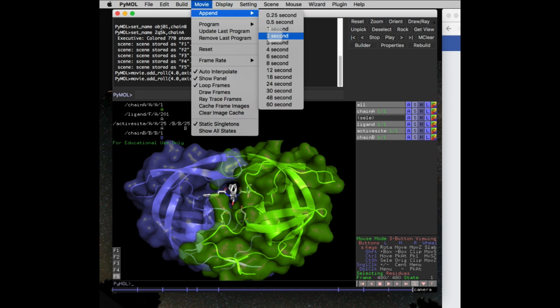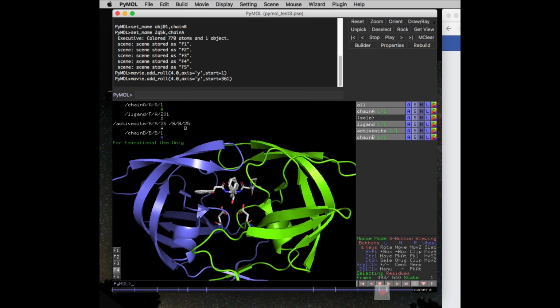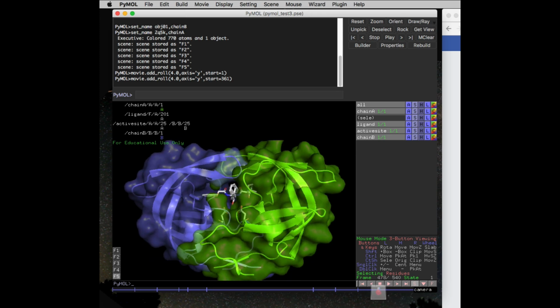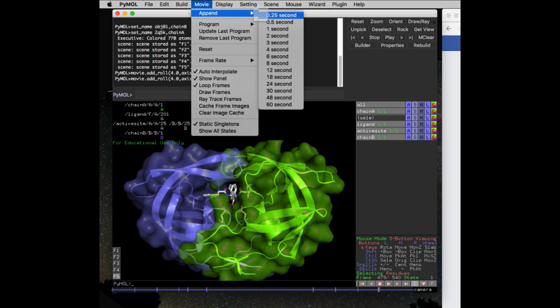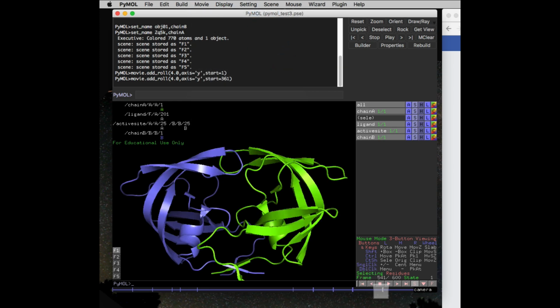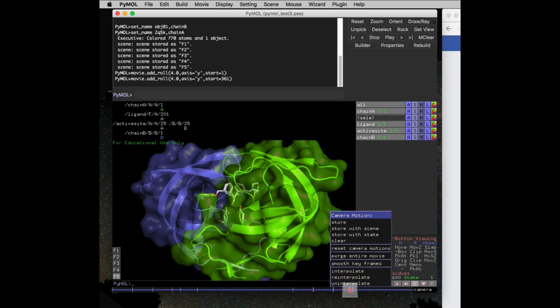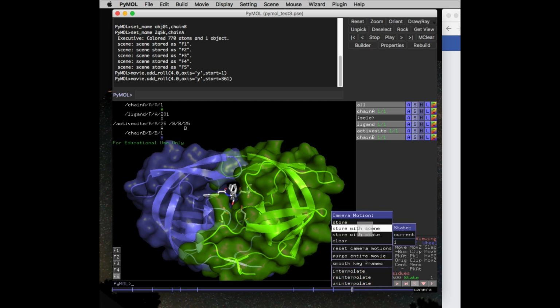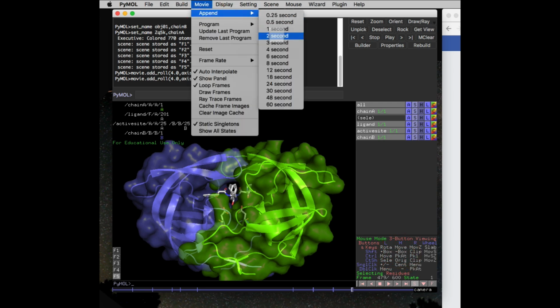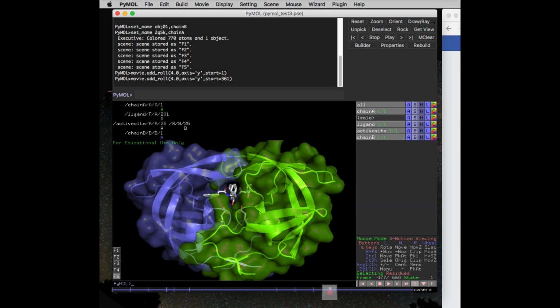We'll immediately append a couple of seconds. Where'd that go? Oh yeah. It's a little annoying. Sometimes there's a little bit difficult placement of where you place those, but now I'll try again to append a couple of seconds. No, still not there. Store with scene, storing with scene 5, append a few seconds. It's really being a pain.